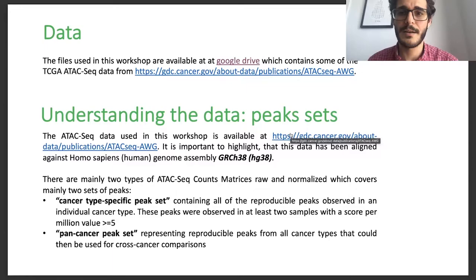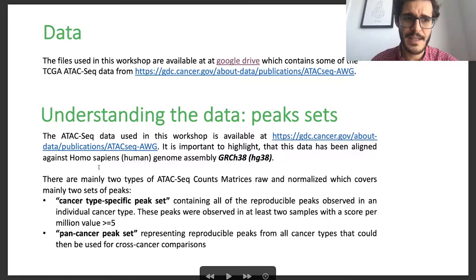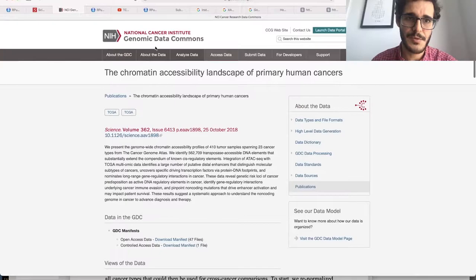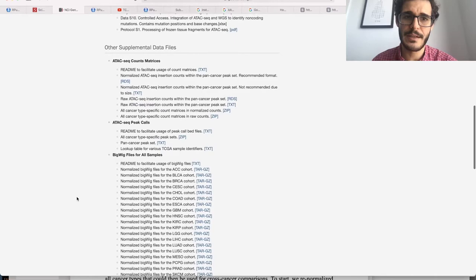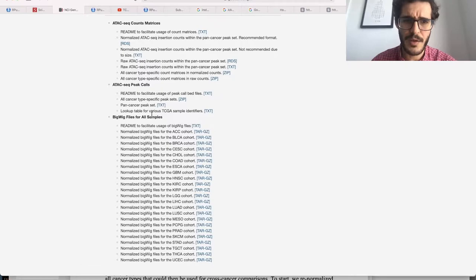The first step is understanding the data — what are the peak sets that we have? This data has been aligned against the human genome assembly HG38, and it's available on the Genomic Data Commons webpage: the Chromatin Accessibility Landscape of Primary Human Cancers. We have a link for the article, all the supplemental data files, and then the data you can use for your analysis.